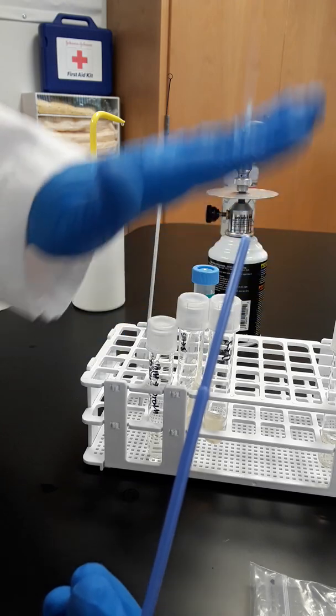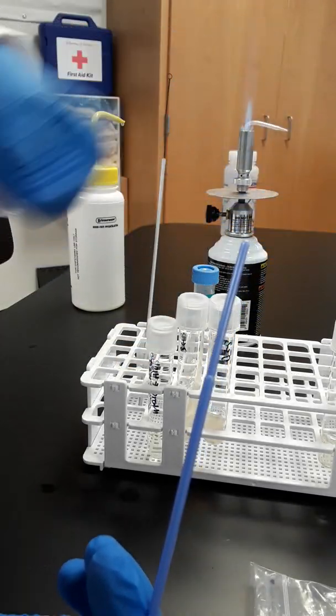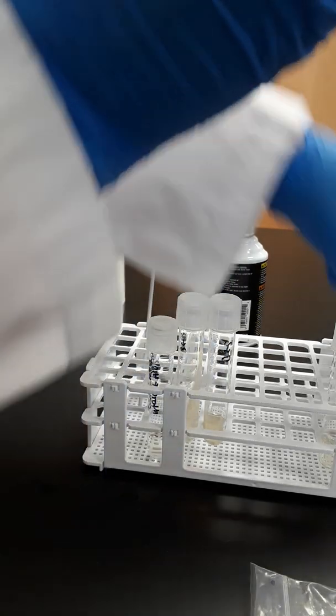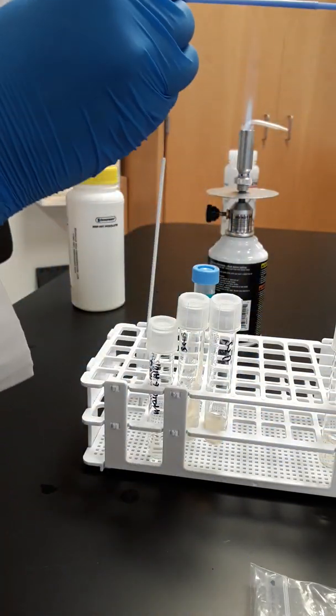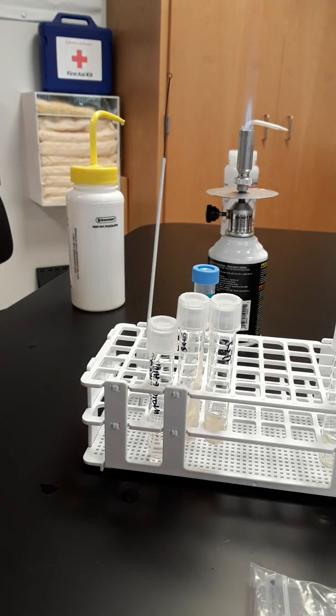And we do the exact same things with the broth. The broth is a little bit easier to inoculate from. Because this is a demo, I'm just going to show you. Pretend that this is sterile again. First, the trick to the broth is you want to shake it first to make sure that all the bacteria are up and out. Maybe I don't want to use this one.